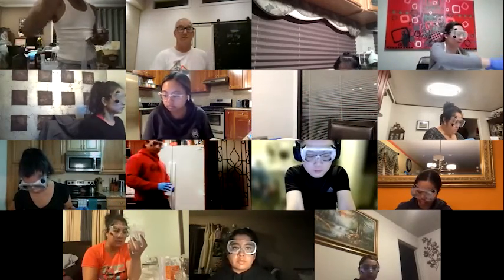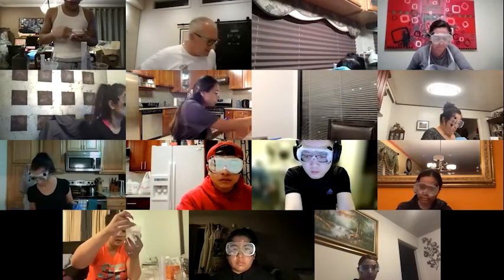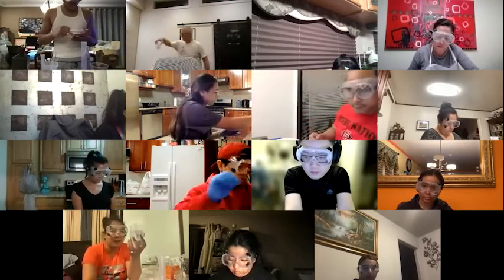Mine from number 3 slowed down significantly. It looks like the water's still moving out. Let me check mine. Yeah, that's the one with the dilute HCl. I haven't looked at mine, I'm just worried about the time frame because I can't stay up all night waiting for this one.